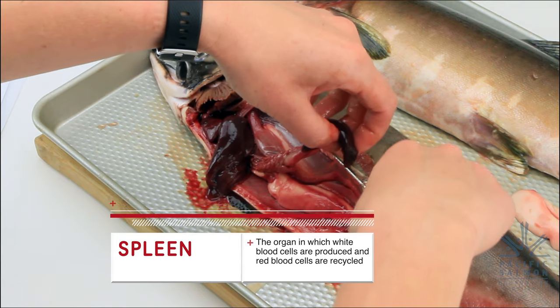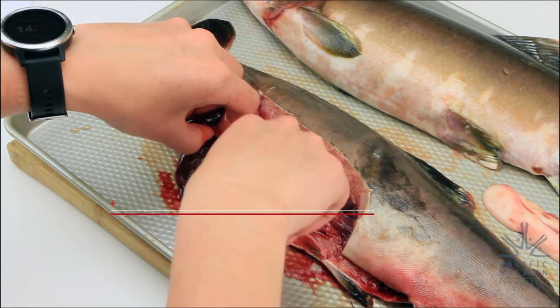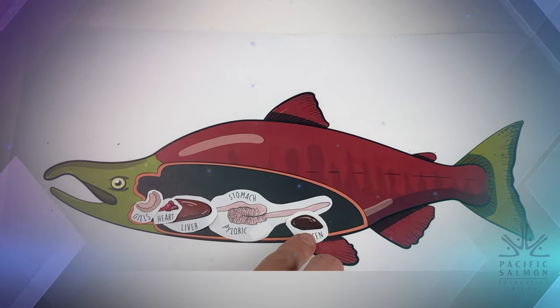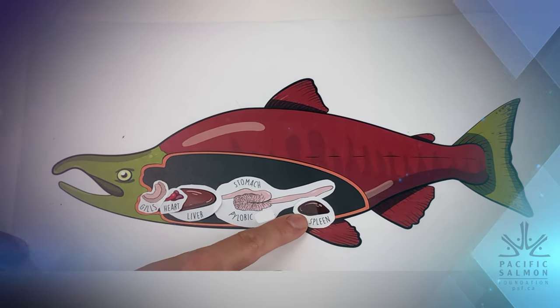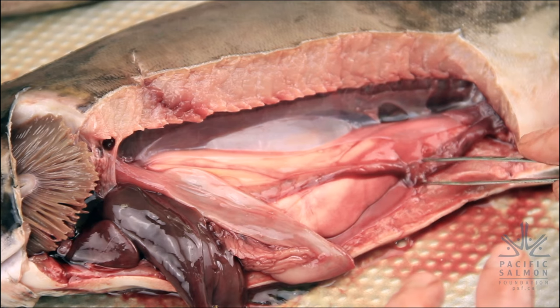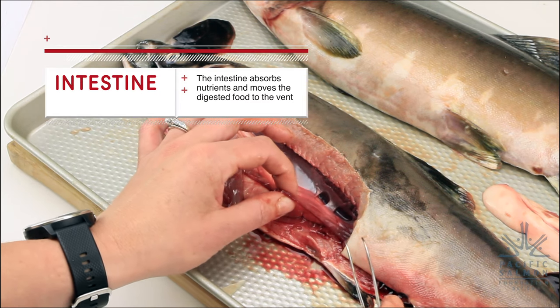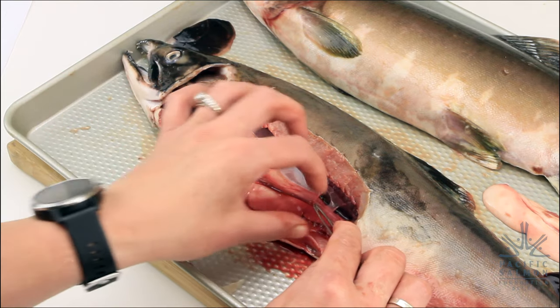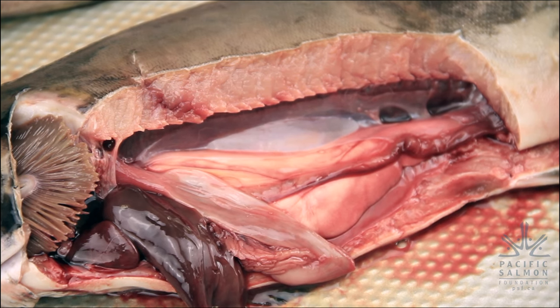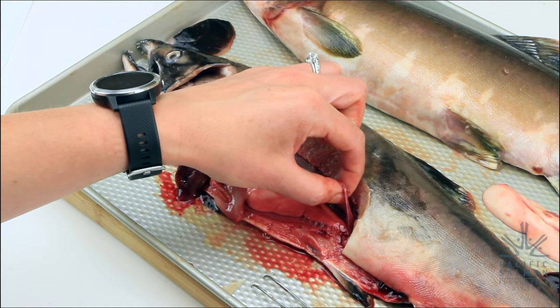Here's the spleen — we'll cut that out of the way. Cut out the spleen from the diagram and put it in your fish diagram; it goes below the stomach. This tube connected to the stomach and running down towards the vent is the fish's intestine. Fish are a little different from us in that they only have one intestine. It takes digested food from the stomach and moves it towards the vent to be excreted, and the intestine is also where most nutrients are absorbed.